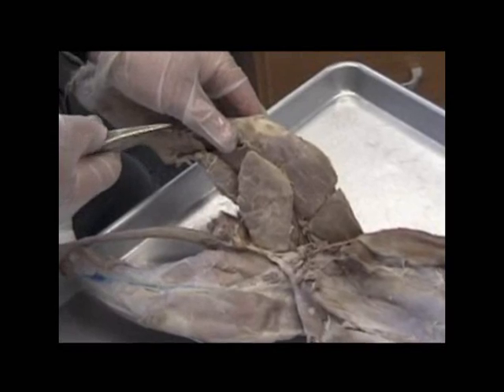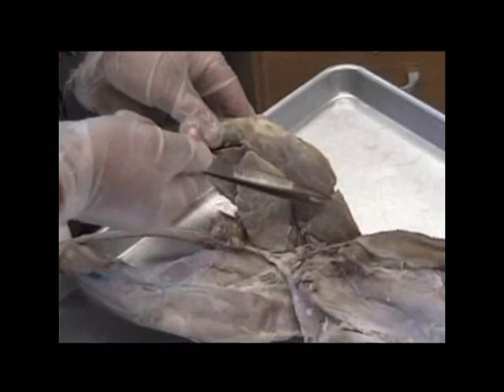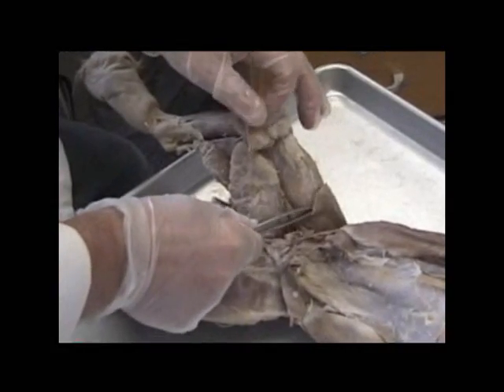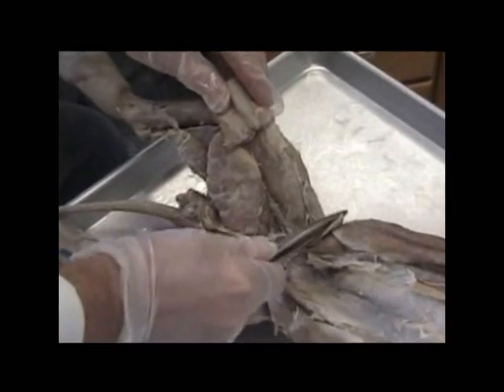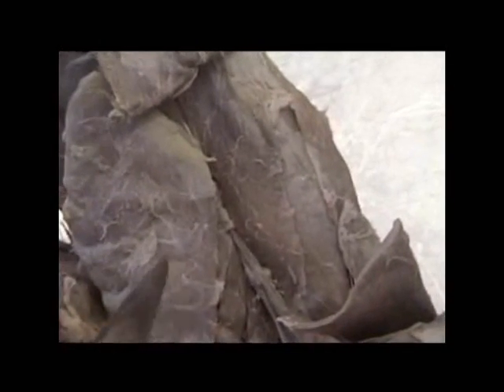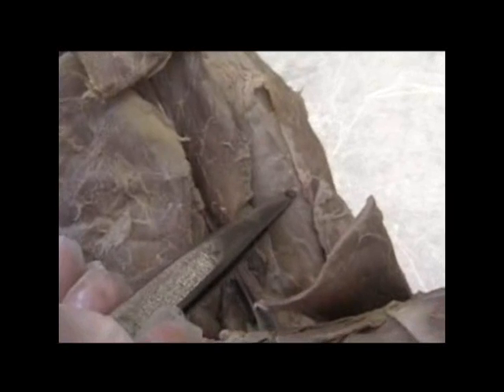Moving to the upper leg of the cat, or the thigh, we're looking superficially at the sartorius muscle, the longest muscle in the body, the longest muscle in the cat. And if we pull the sartorius back, it's been bisected, we can see the quadriceps femoris, or the quad group, named because there are four components. Starting laterally, this is the vastus lateralis on the lateral side, vastus medialis on the medial side, rectus femoris running right down the middle, and deep to the rectus femoris is the vastus intermedius.